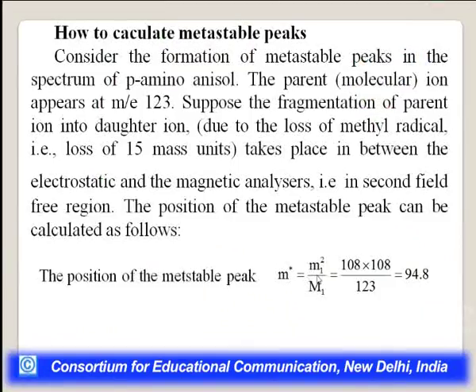So, we can calculate by this value: m* is equal to m1, that is the value for the daughter ion, whole square, divided by the molecular mass of the parent ion. Consider the formation of metastable peaks in the spectrum of para-amino anisole.